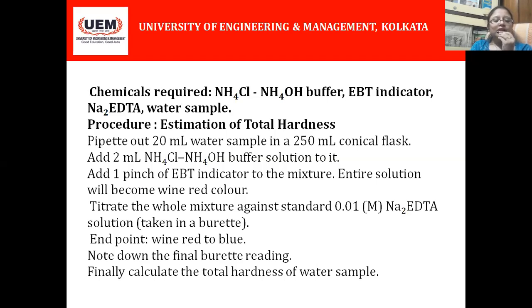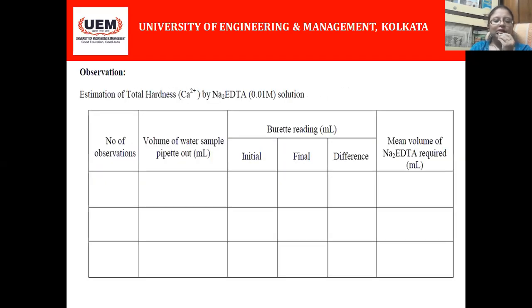Then you will titrate this solution against standard 0.01 molar disodium EDTA solution. It is taken in the burette. So at the end point, you will get a wine red to blue color change. Finally, you should calculate the water hardness.